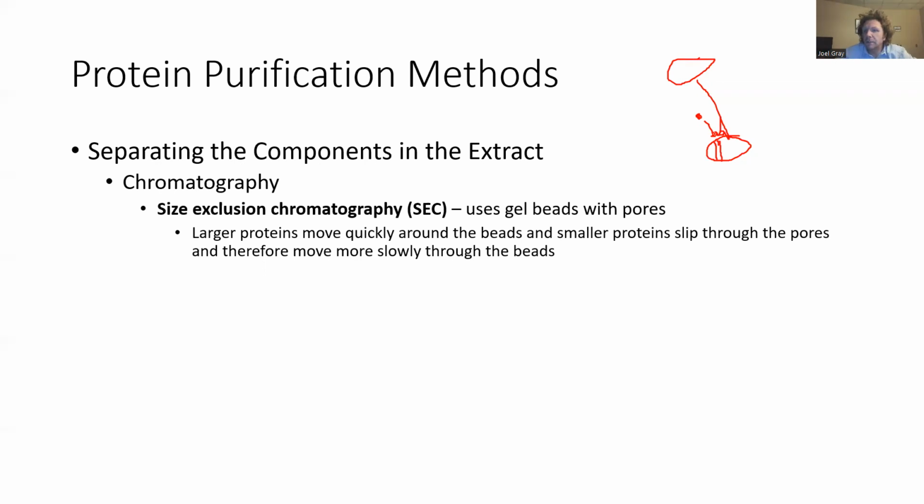So large proteins do not migrate into gel filtration beads, because they don't even enter the beads. What that means is they hit the bead and move forward. They move down that column. So gel filtration chromatography shows that your largest proteins migrate through the column at the fastest rate. Your smallest proteins migrate at the slowest rate.